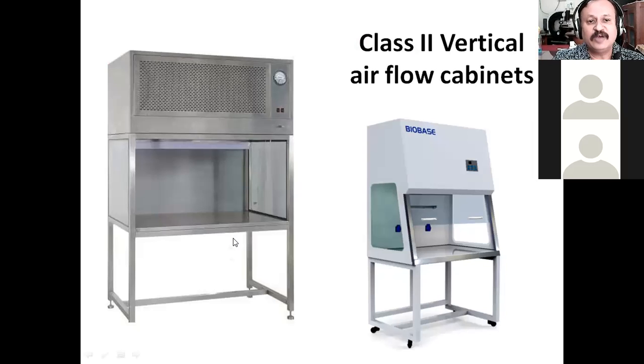Okay, then this is how a vertical airflow cabinet would look like. We have a similar kind of biosafety cabinet in our department also. Whenever you get a chance to visit the department, you will be able to see this biosafety cabinet, and you may also be able to work in it. We also have ordinary horizontal type of laminar airflow cabinets in our department. So both the types of cabinets we have in the department.